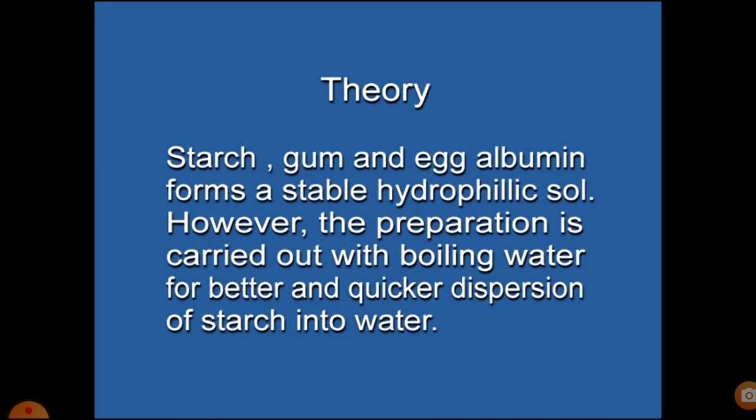Theory for lyophilic sol: starch, gum and egg albumin form a stable hydrophilic sol. However, the preparation is carried out with boiling water for better and quicker dispersion of starch into water.